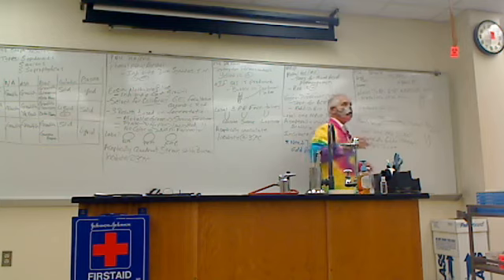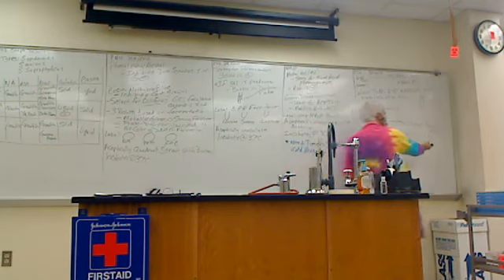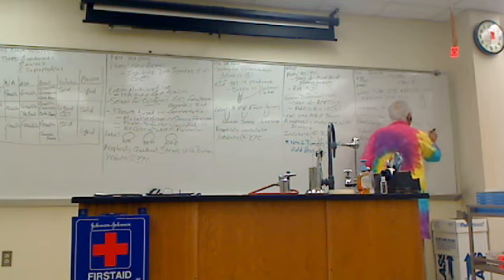So when you do this, you take your loop, guys, go to the bottom of the slant, okay? And you're going to zigzag it going up.